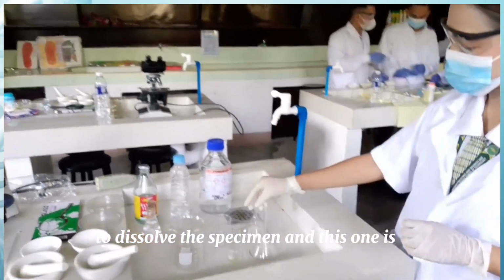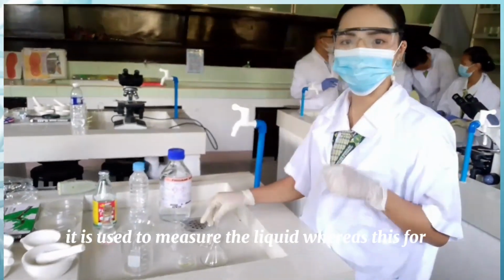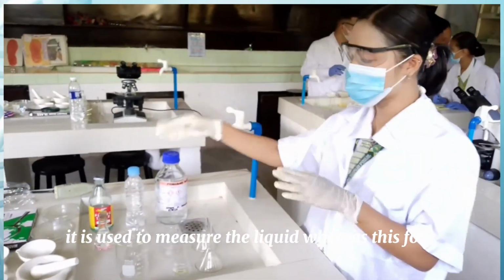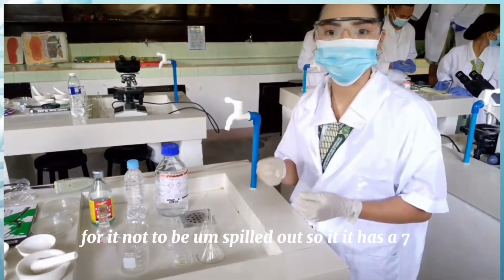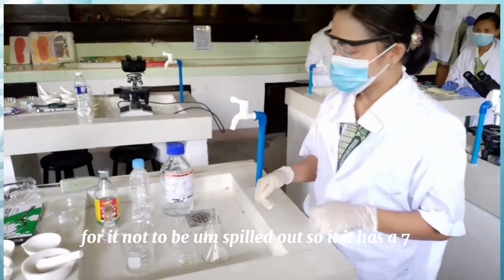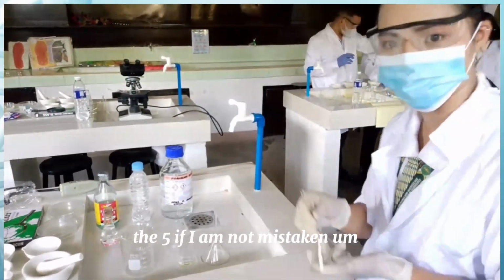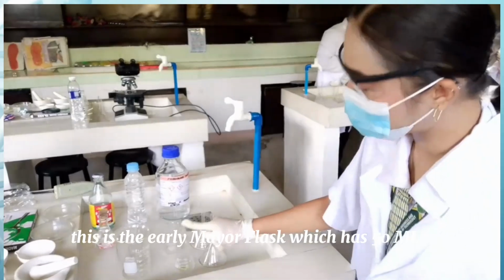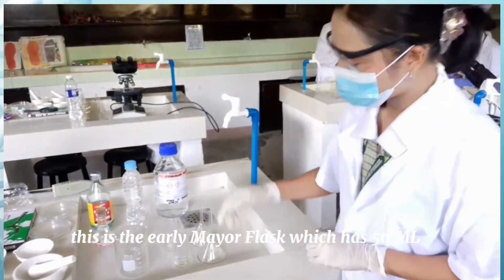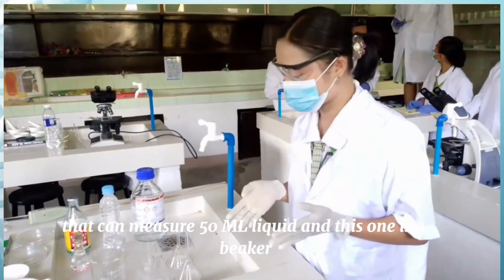And this one is the funnel, rather, used to pour the liquid so that it is not spilled out. So it has 75, if I am not mistaken. This is the Erlenmeyer flask, which has 50 ml, that can measure 50 ml of liquid.